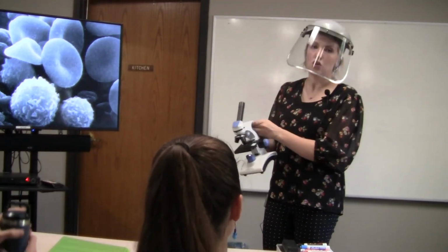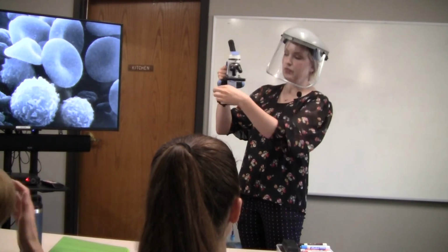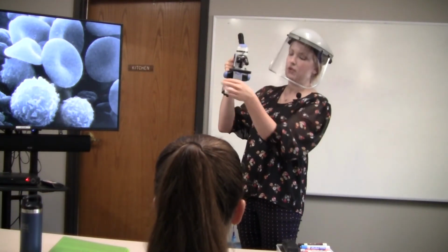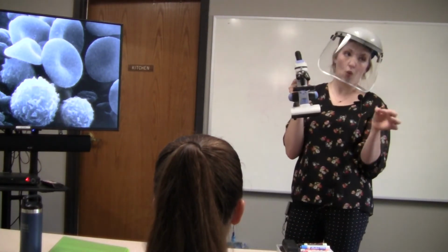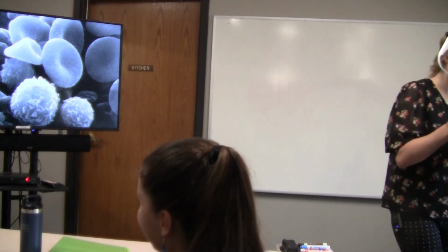Remember that you can adjust the amount of light that's coming in and out, both with the adjustment knob for the light and then also with the diaphragm. That will change the size of the hole which the light is coming through. So both of those are ways that you can do that.